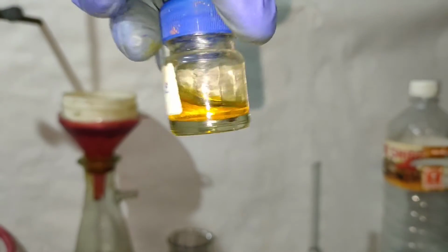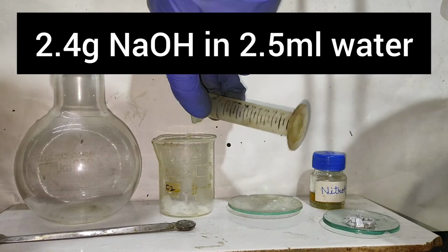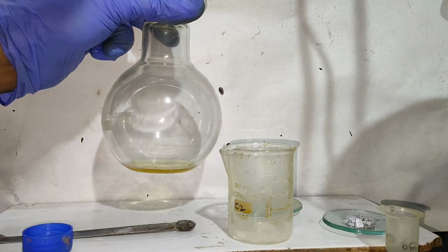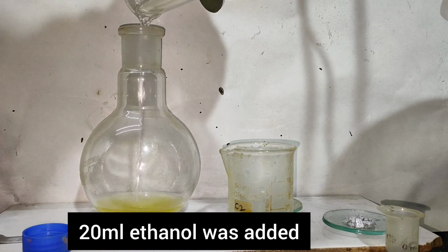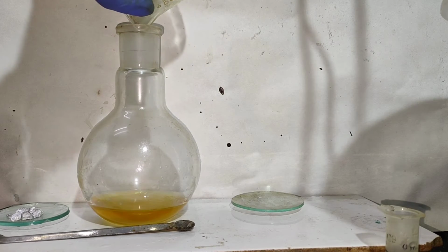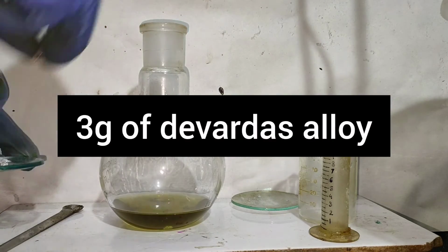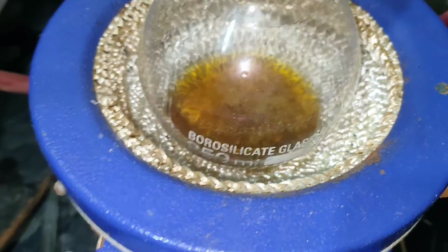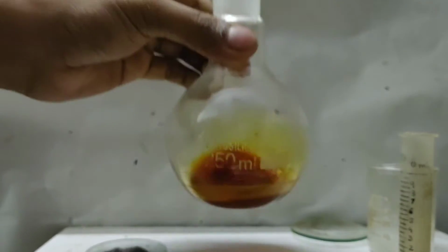Now I was left with only 2 ml nitrobenzene, so I took 2.4 gram of sodium hydroxide and 2.5 ml of water. Then the 2 ml nitrobenzene was transferred to a flask and to it 20 ml ethanol was added. Then the sodium hydroxide solution was added. Then I added 3 grams of Devarda's alloy. But since the reaction was too slow, I heated it on a heating mantle. But still, due to large pieces, the reaction was very slow.